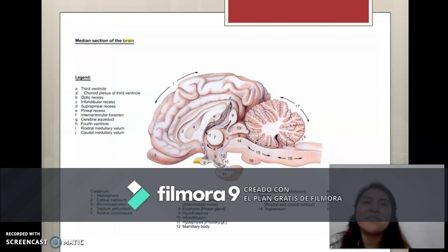Midbrain, also known as the mesencephalon, is one of the primary divisions of the brainstem. Its functions extend to many different parts of the central and peripheral nervous system, motor and cognitive abilities. Pons is part of the brainstem area and relays messages from the cortex and the cerebellum. And the last is the medulla oblongata. It controls the functions of the heart, lungs, and intestines. The medulla oblongata is shaped like a truncated cone. The last one is the cerebral cortex. It's the outer layer of each hemisphere. This is where the main functions of the cerebral hemispheres are carried out.